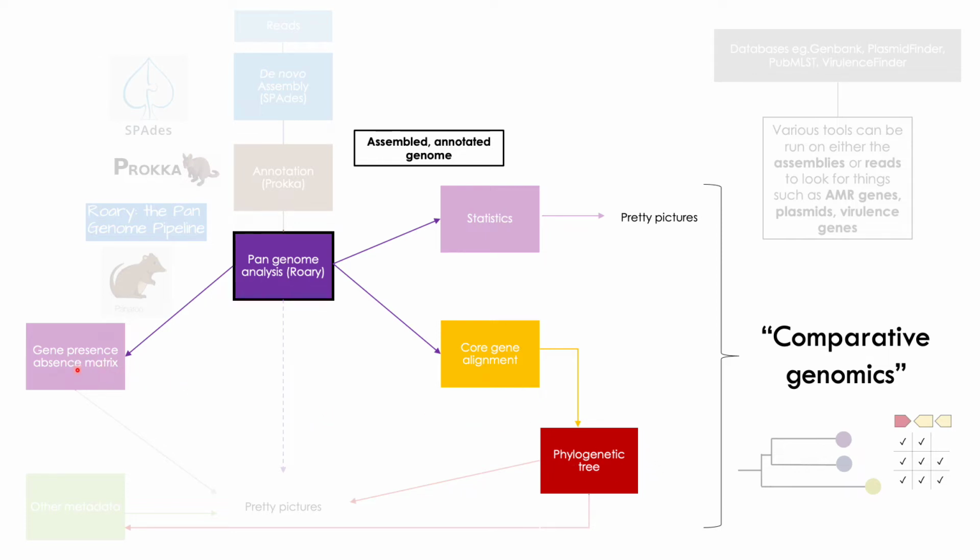We also get a gene presence-absence matrix, and as the name suggests, it's literally a binary matrix where you have all of the genes in a pan genome, and whether they're absent or present in all of the genomes that you're comparing. This is really good because you can query for target genes or operons, or you can compare presence or absence of genes across various groupings, either that you see in a tree or other groups from your metadata, such as asymptomatic versus disease or anything like that.